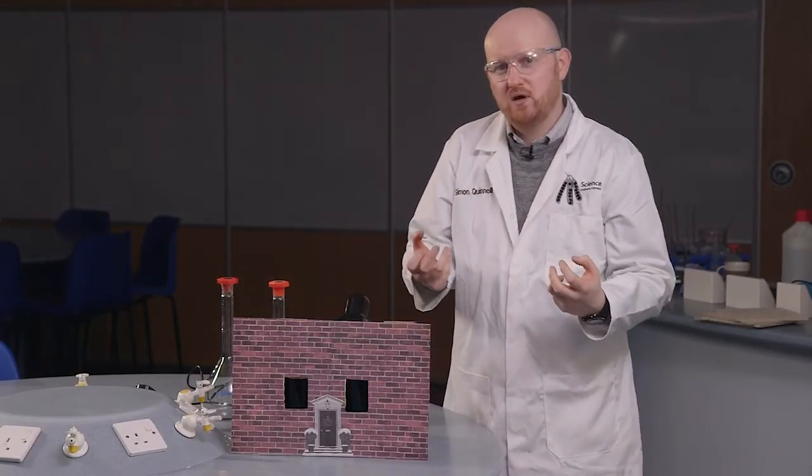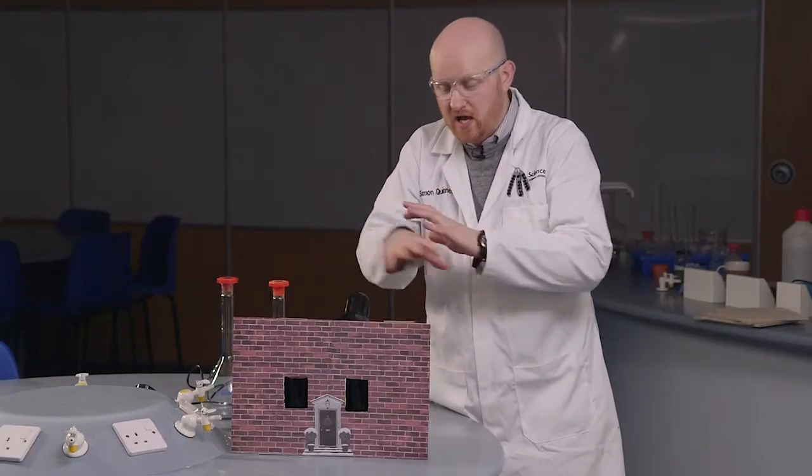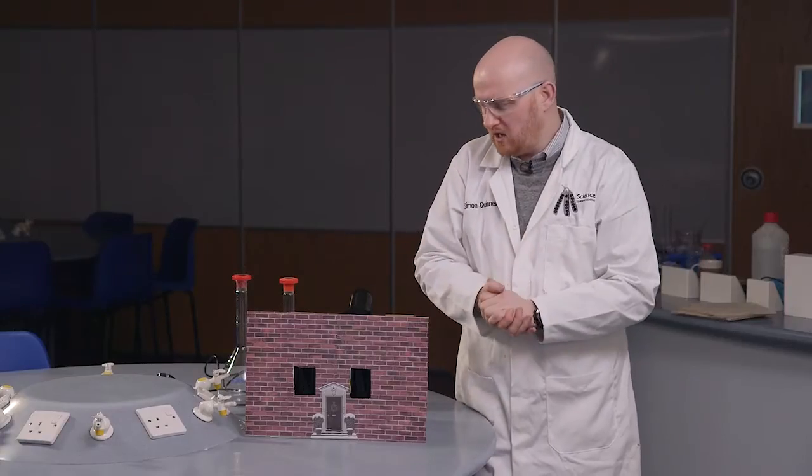So that's a really nice way of showing and using the iodine clock in a nice scenario and a good theme there. Of course you can use the iodine clock in many other ways and use it in different lessons and different topics. It's a really nice change and reaction.